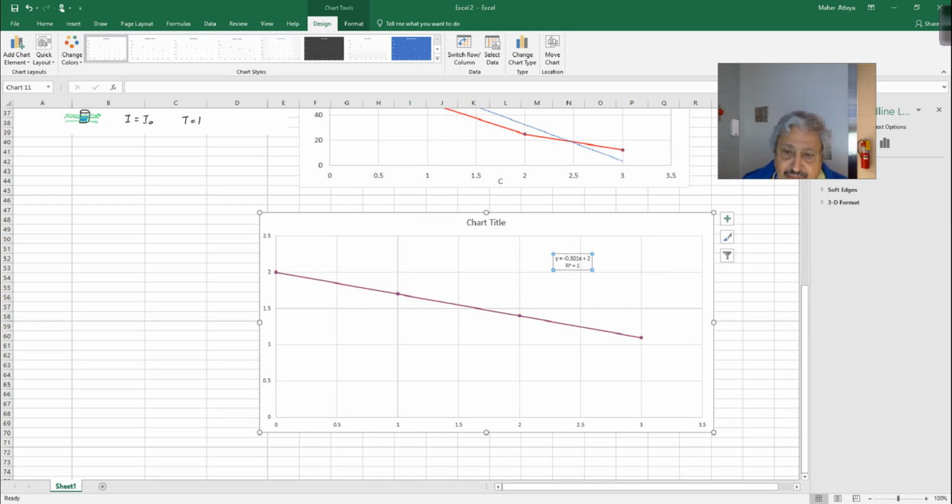But anyway, you can see the regression is the dots. You can't see it very well, but these are small tiny dots on the curve, and the regression is 1.0. So all those points are on the top. 1.0 is the highest value, the best regression. Then you enter the chart name, the title name, the axis. You can put an arrow in front of the axis. You can do a lot of customization. You have those in my own.